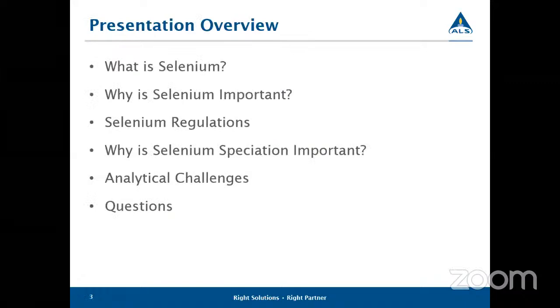So, a brief overview of my presentation. What will I be covering? I'll briefly be covering what selenium is, why selenium is important, and selenium regulations, and only briefly on the regulations because it is a very evolving topic and constantly changing. Why is selenium speciation important in relation to selenium regulations? Then some analytical challenges related to selenium speciation, and then we'll open up for questions.